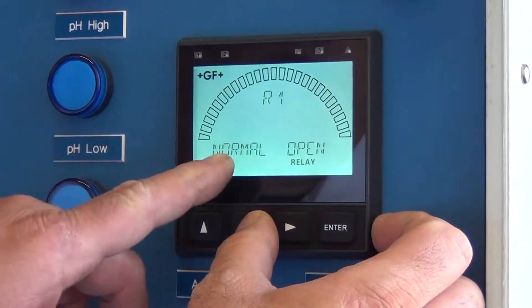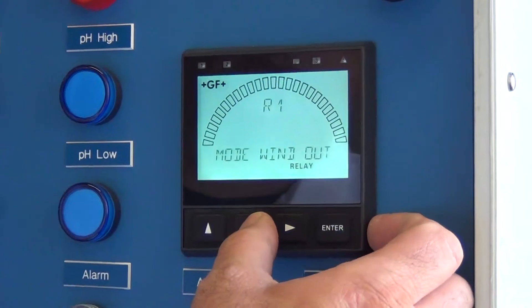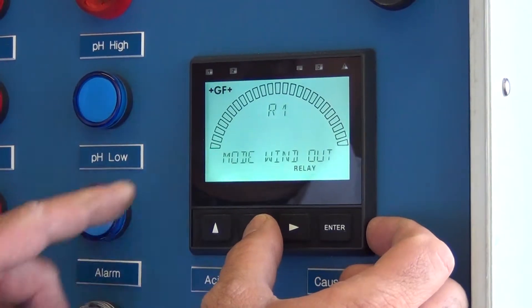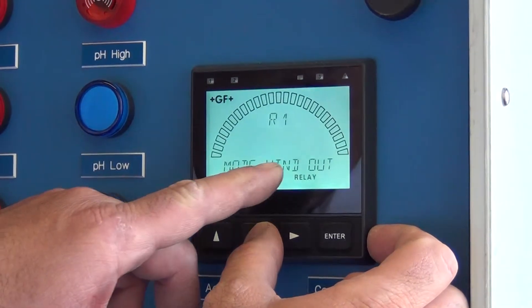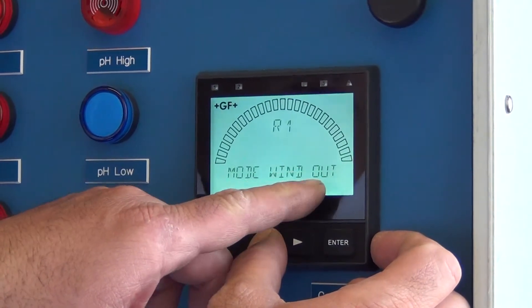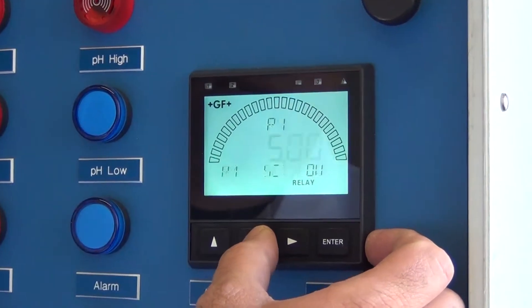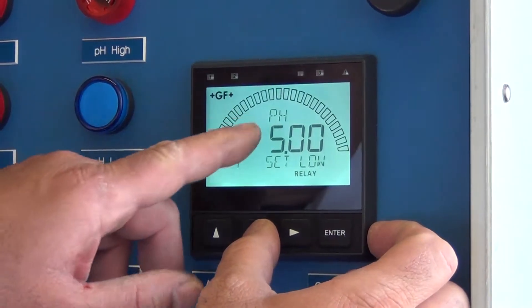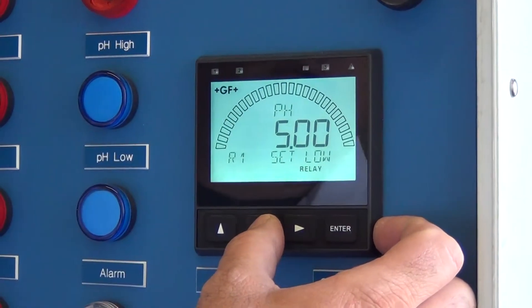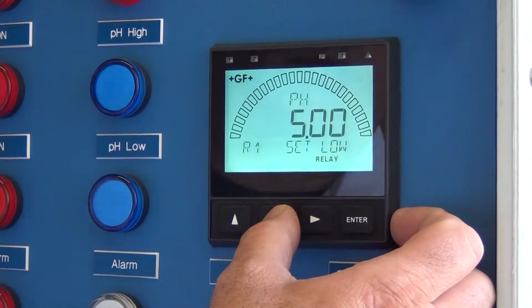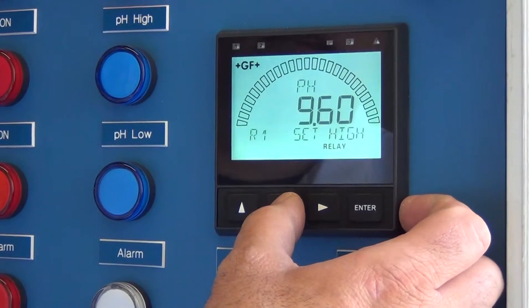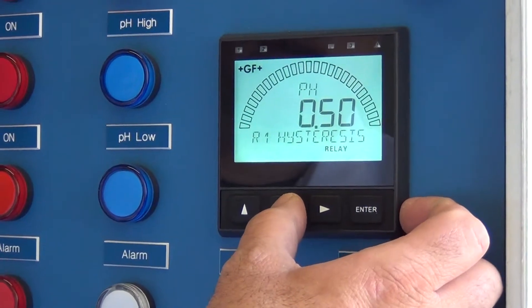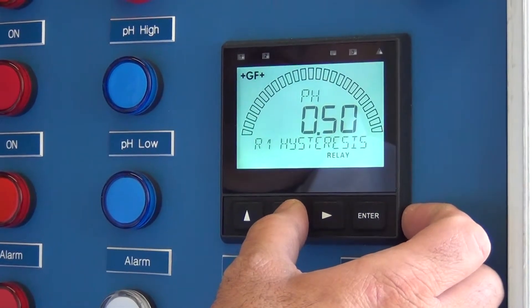R1 is normally open. The mode is window out. Right now we have it set with 5 on the low end and 9.6 on the high end.